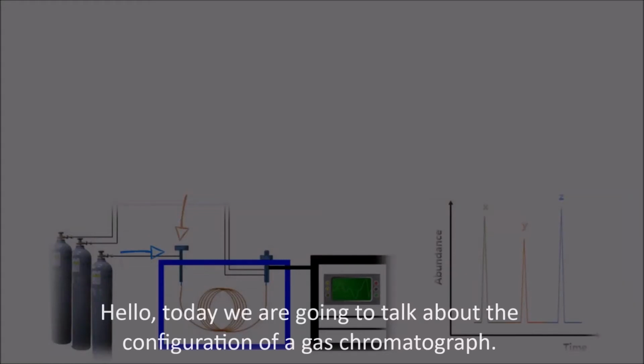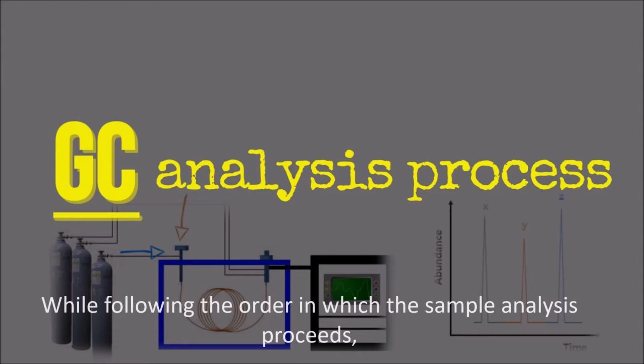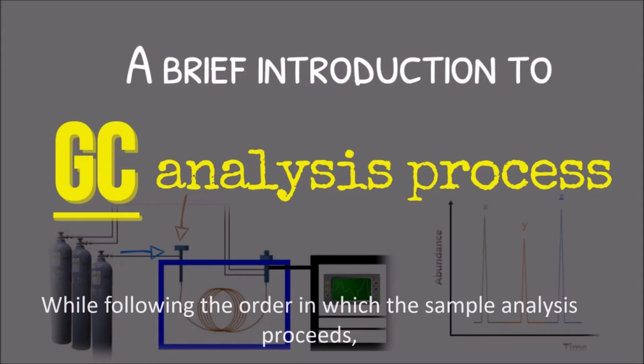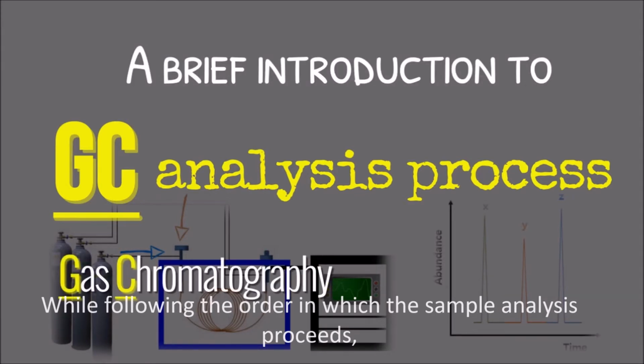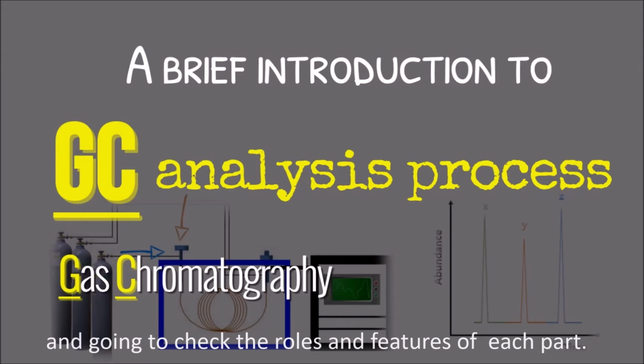Hello, today we are going to talk about the configuration of a gas chromatograph. While following the order in which the sample analysis proceeds, we are going to check the main parts of a gas chromatography analyzer and the roles and features of each part.